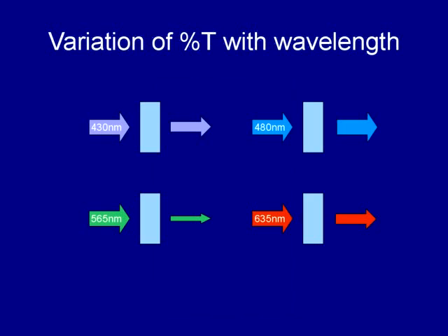Every sample you are provided with has a different color and absorbs light at a different wavelength. In the graph, you can see an example. It is clear that the green light gets absorbed the most, while blue light has almost no absorbance. Which color of light then must you use for your sample? Think about it. Do you want a wavelength that is highly transmitted or one that has low transmittance?